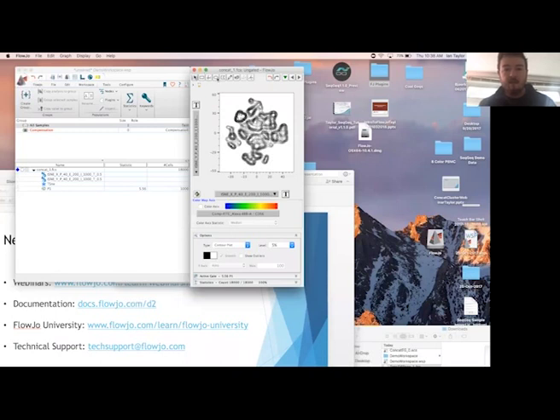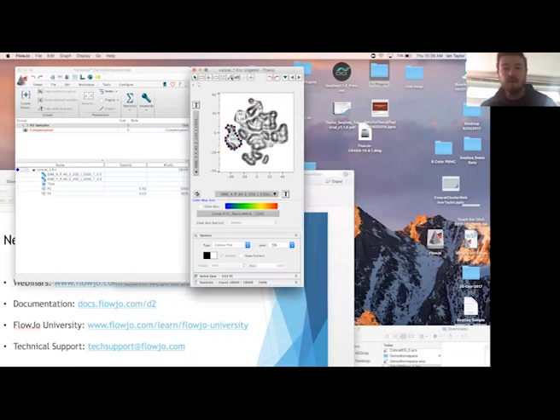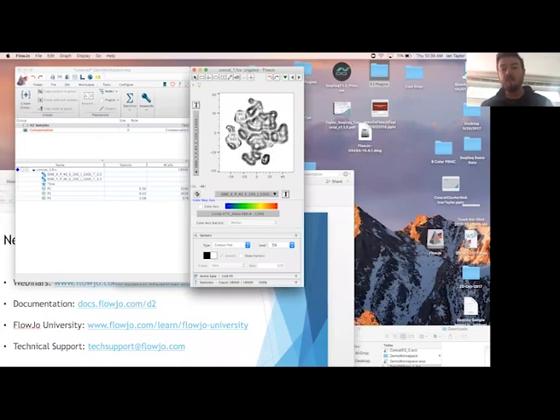So we've got a P1 identified. Maybe we'll just do a couple more before we move on to looking at the different samples. So this will be our P2 island population. And maybe something a little further away, like this little guy here. Call that P3. And again, we might investigate and figure out what these are, and we could rename them, or things of that nature. We could also dig into these populations. We could look at what other markers are expressed there, or if there are subpopulations. You can even run t-SNE again on a secondary population.